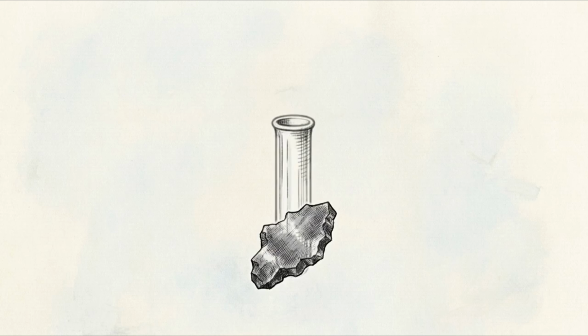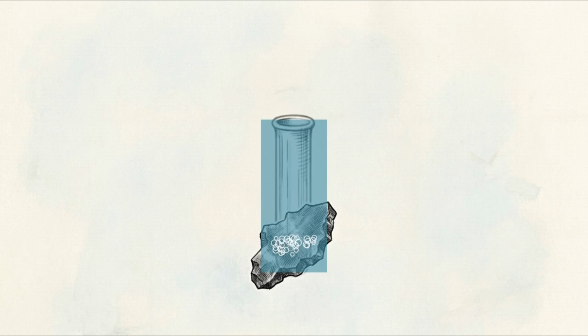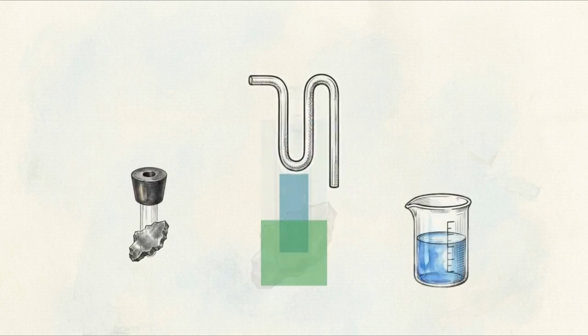The moment the sulfuric acid hits the zinc granules, you will see a rapid formation of gas bubbles erupting directly on the surface of the metal. But we have an immediate problem. The gas being produced is completely invisible and odorless. If this tube were open to the air, the gas would mix into the atmosphere and be impossible to track. That is exactly why we use the soap solution.